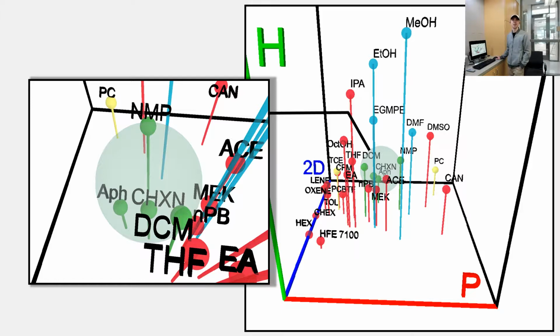They didn't fit in one sphere together either, because they're on opposite sides. That's strange, but they cleaned the Sharpie off the slide pretty well. I haven't found a use for propylene carbonate. It enhances solubility space, but it just doesn't play nice, and I'm surprised that it worked.